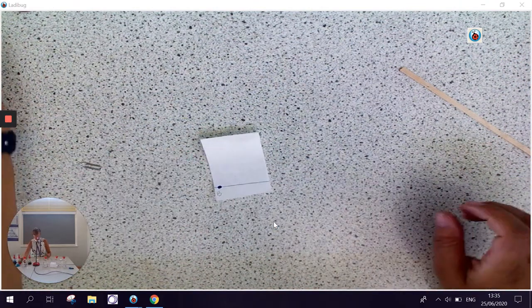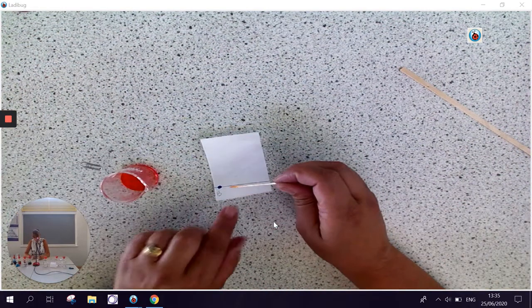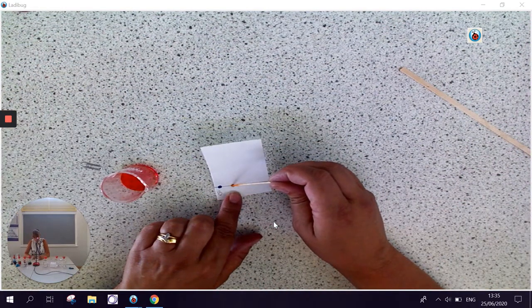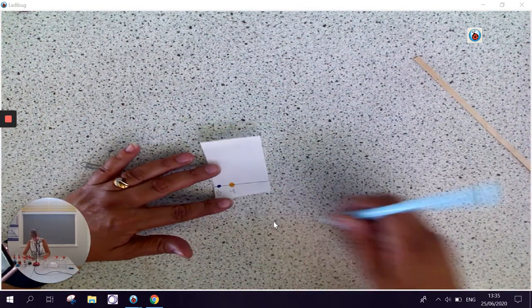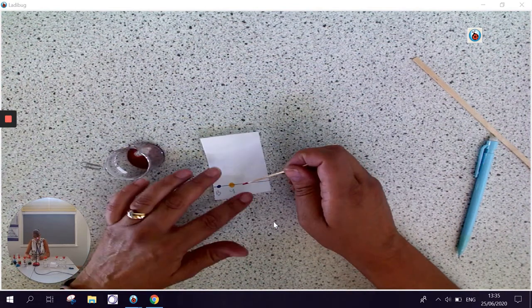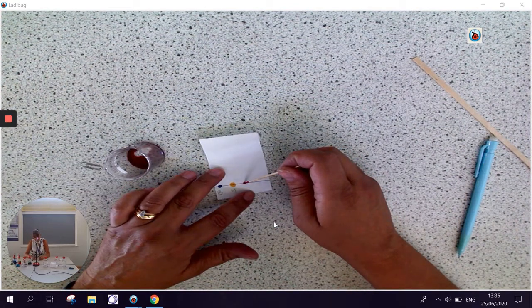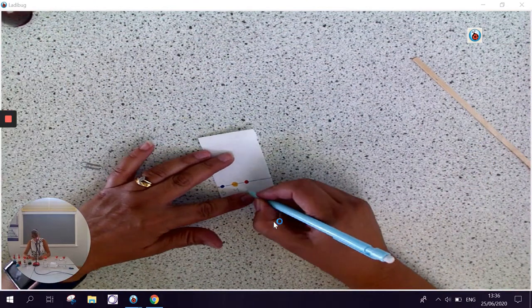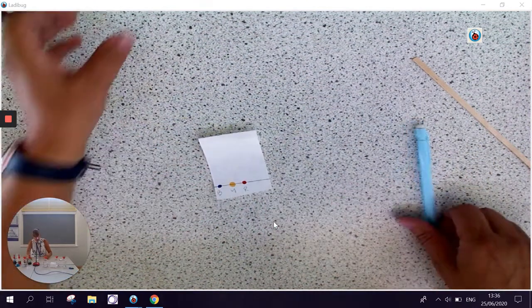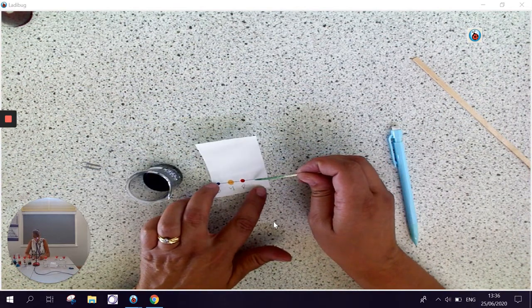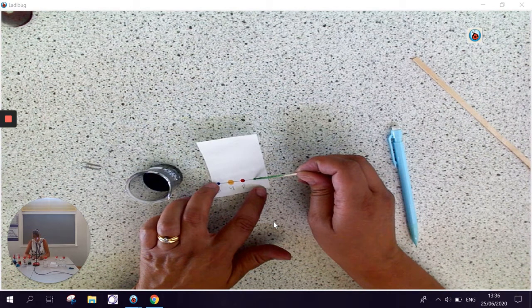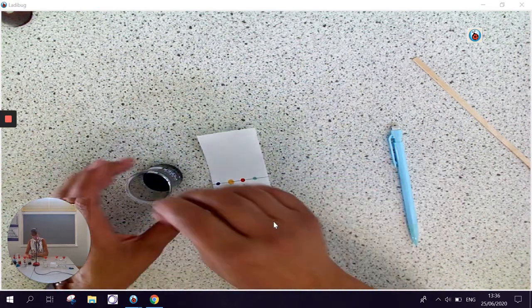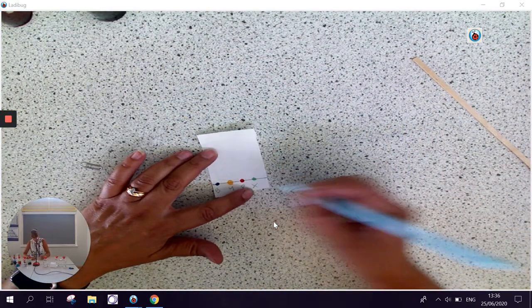I'm going to put a dot of yellow, a dot of red, and then a dot of the unknown colour. I'll call it unknown colour X.